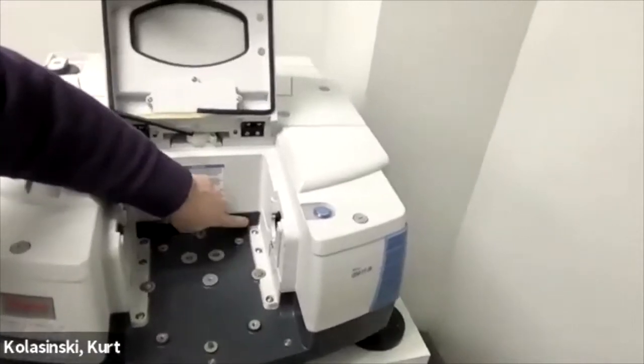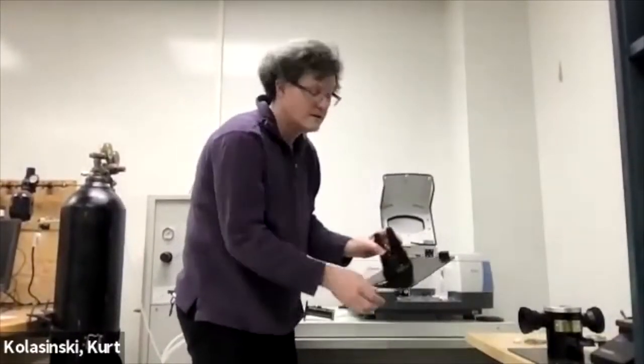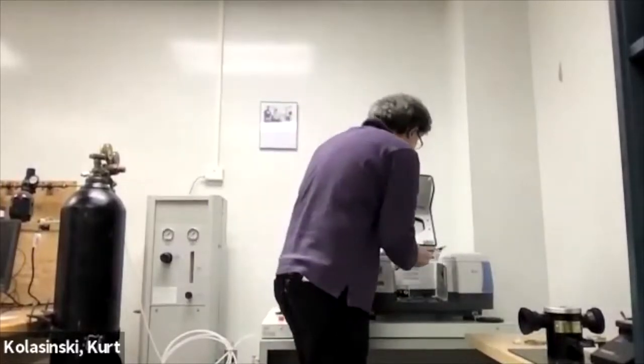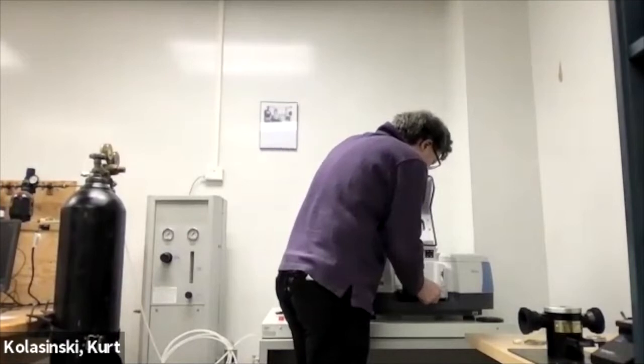There are these three electrodes back here. Okay, what do all of those do? The two posts are for lining up the two alignment holes here. Boom. Boom.